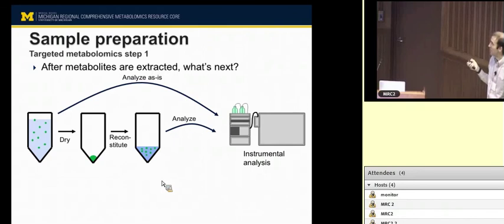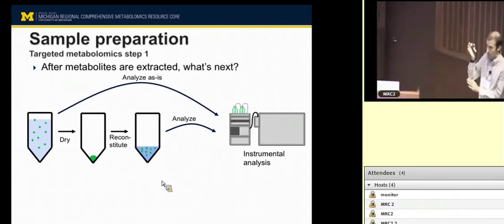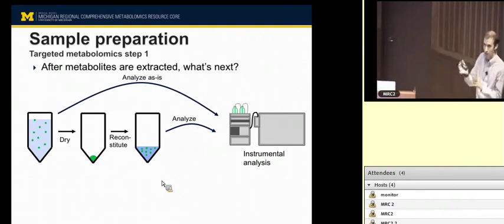Let's find everything that could possibly be a metabolite, and then let's look at it and see if it's of interest. Okay, and so then the next step is feature alignment. We want to find not just all the features in all the samples and say we're done. We want to say which features are in common between samples, and align those so that we can put data from a single compound, ideally a metabolite, in the same column and compare them from one sample to another, from one group to another. Sometimes there's multiple steps that take place here.